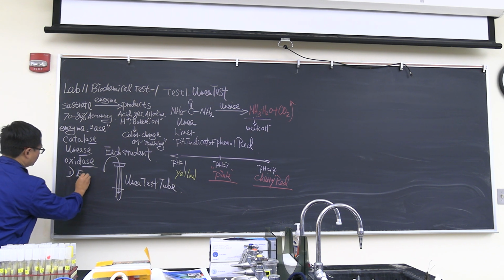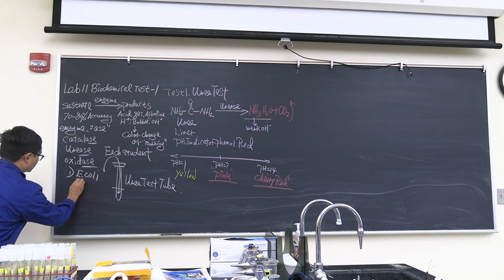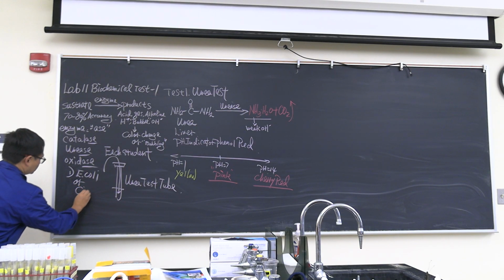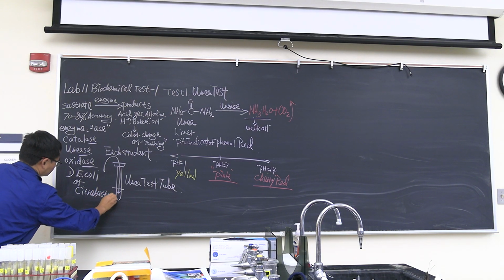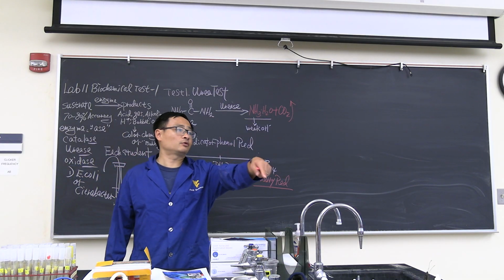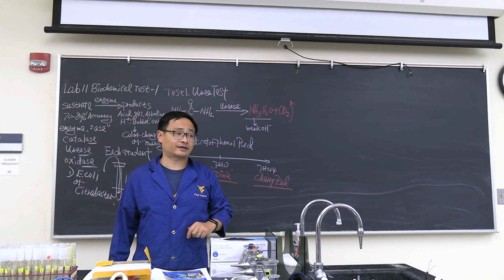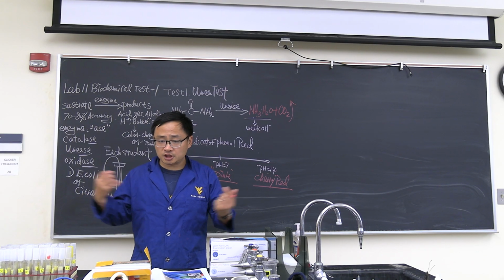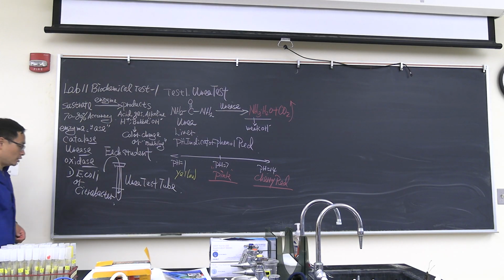If you are inoculating E. coli, you bench partner inoculate Citrobacter. Okay? So let's say from the bench number 1, you inoculate the E. coli, you bench partner inoculate Citrobacter. Then the results you share on Thursday. Okay? It's very simple. Now what are we missing?